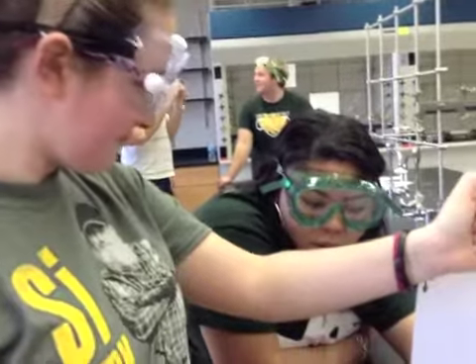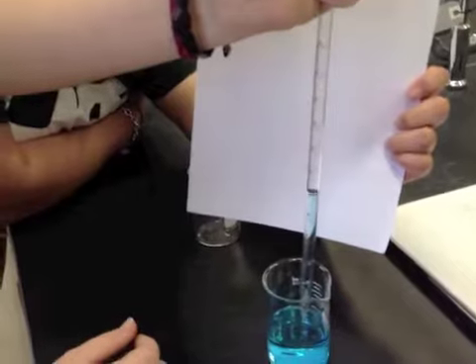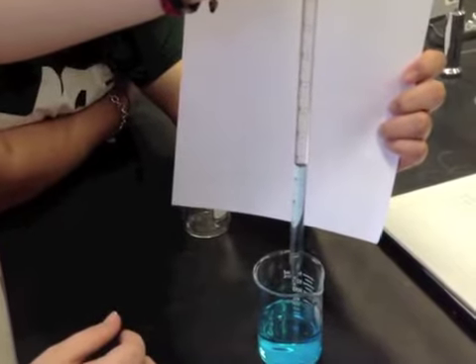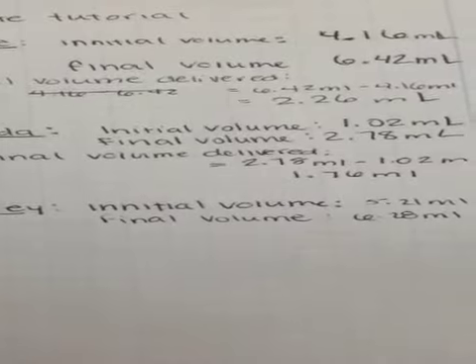Let some of the water out and you're going to read your final volume. The final volume is 6.28. Final volume 6.28 milliliters.